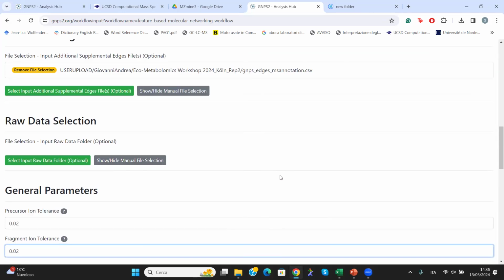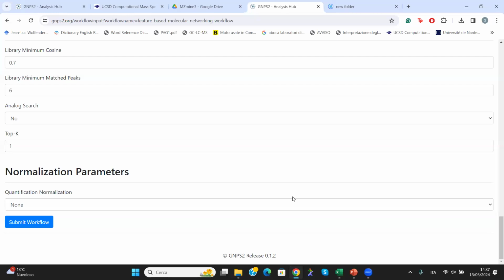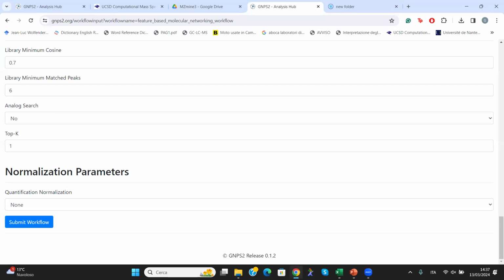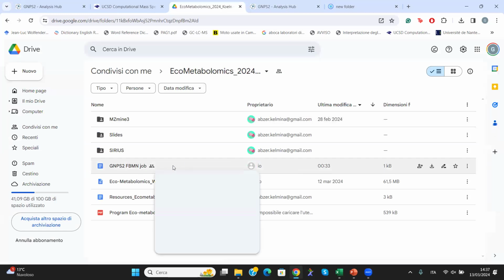So don't worry if you cannot. If you have it ready, feel free to go ahead, or later during the workshop, it would be great if you get your own first job in the user console. In a second, Giovanni will share it with you. Thanks, Daniel. Yes, that's true.